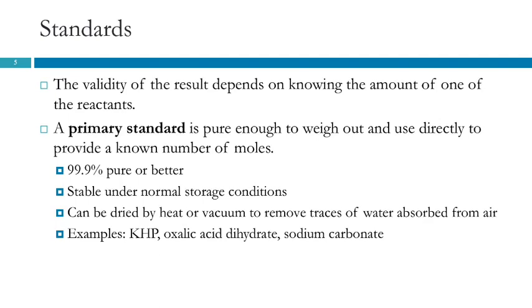Another important thing is that they need to be stable under normal storage conditions. So this is something that you can have in the stockroom, and it's going to last at least months, if not years, just sitting there on the shelf. So that rules out a lot of things.